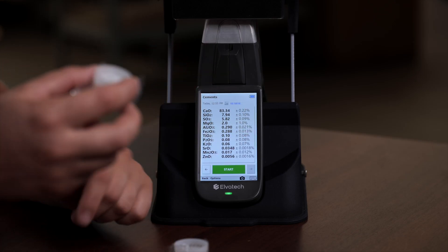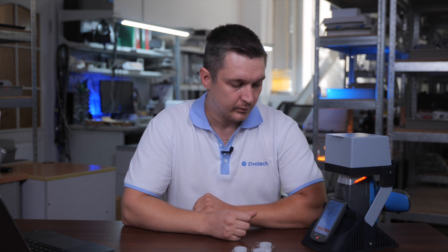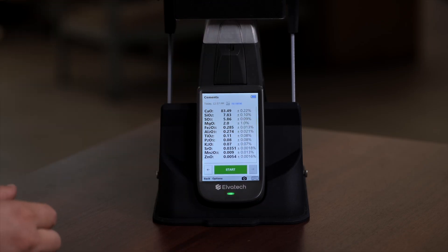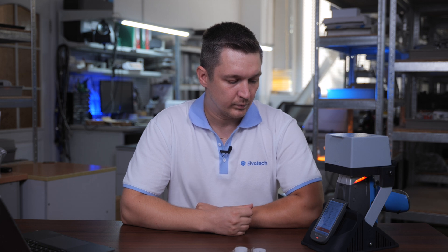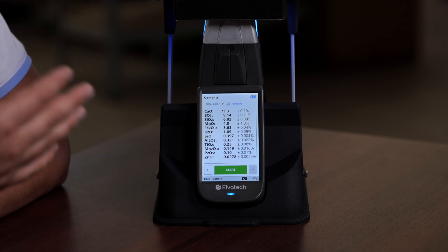And now we will place our third sample, close the lab stand, and push the start button – 10 seconds. Then we will place the fourth sample and start the analysis. As you have seen, we just performed the analysis of four samples and it took us only one minute to analyze all four samples.